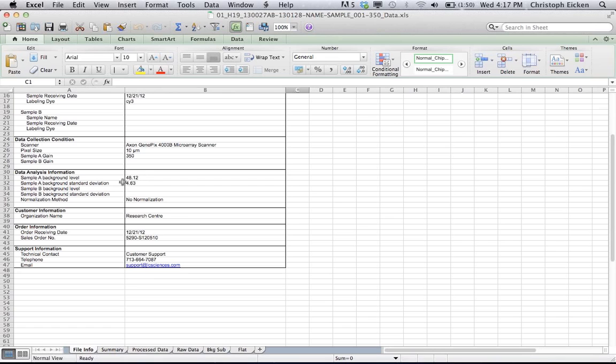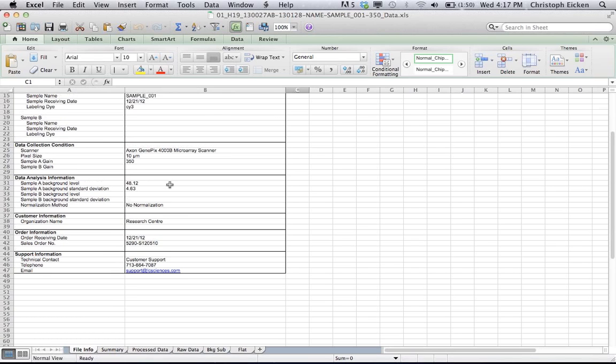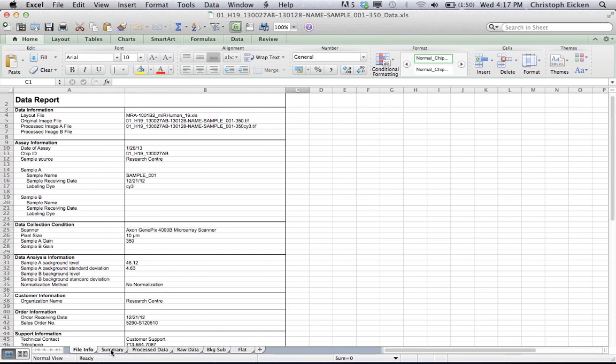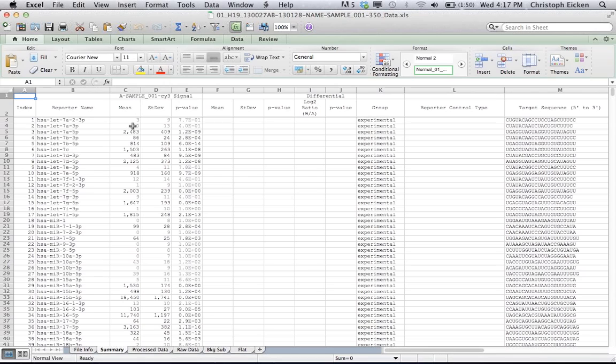the background level, background standard deviation, etc. And then here on the first page is basically the summary. It lists the average, the mean values of the probe, all the different probe repeats, the intensities for the probe repeats and the standard deviation and the p-value of those.